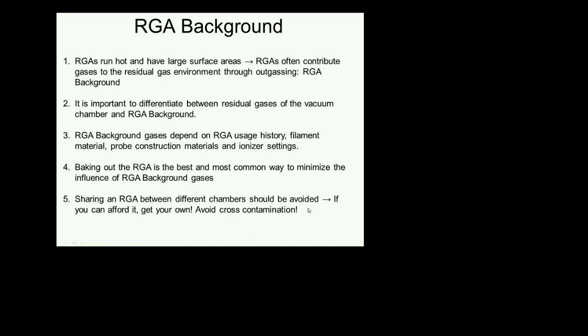I have a good friend who works in extreme high vacuum, in the 10e-13 torr range, and she very often tells me, I use your RGA, but when I turn it on, I'm dominated by the background gases. It's all I see. And then I have to go and find, as minor components, whatever was already in my vacuum system. That's just the nature of the business.